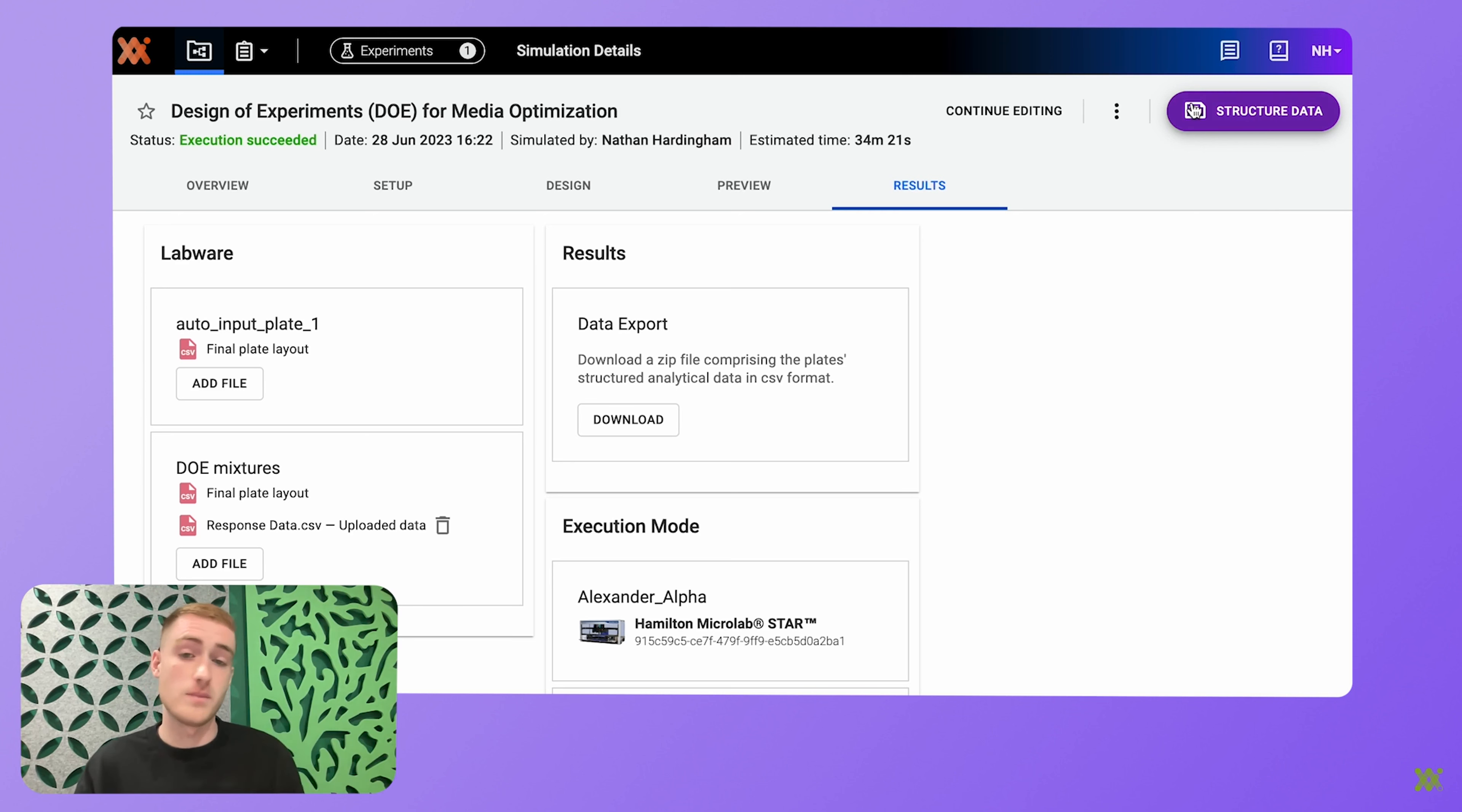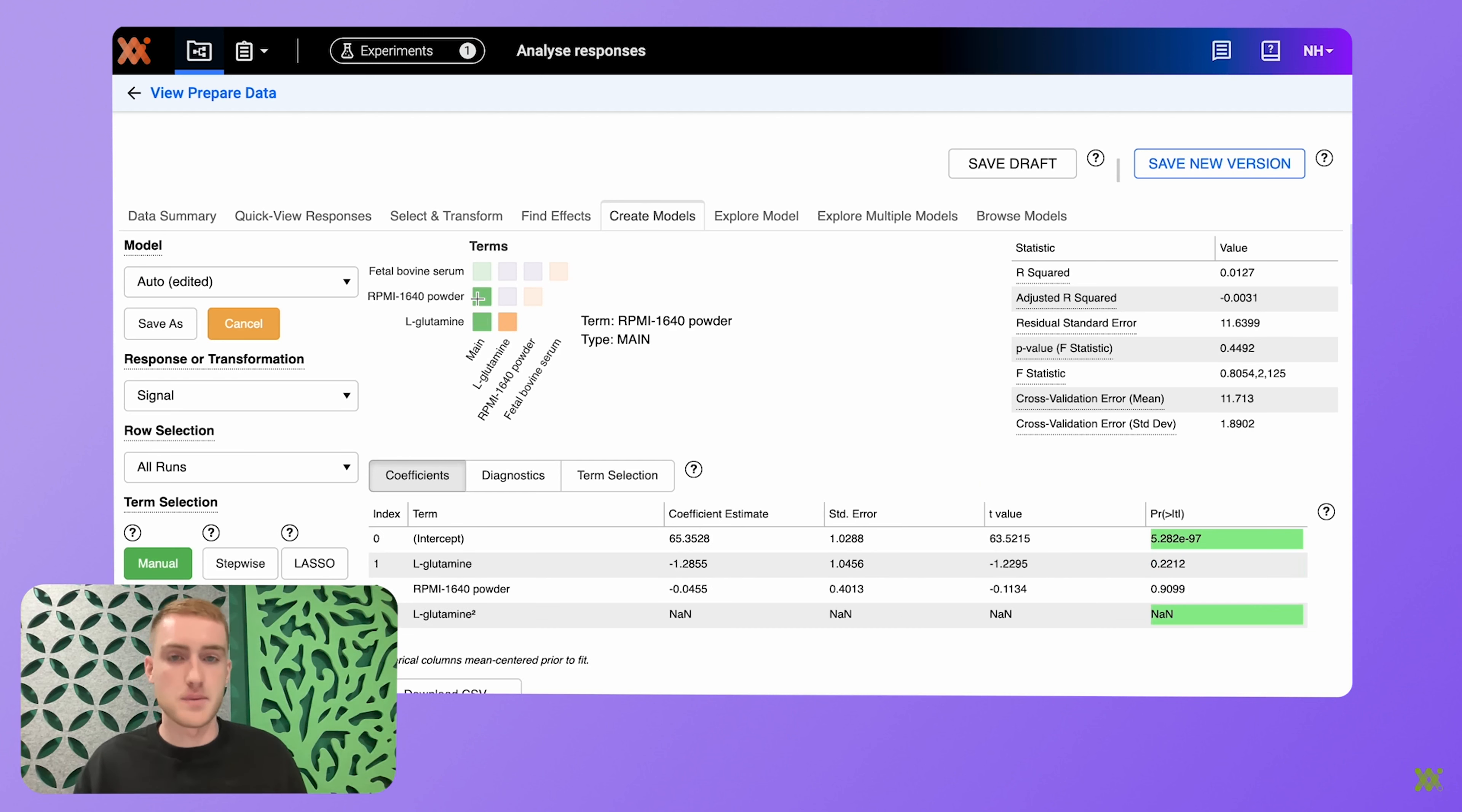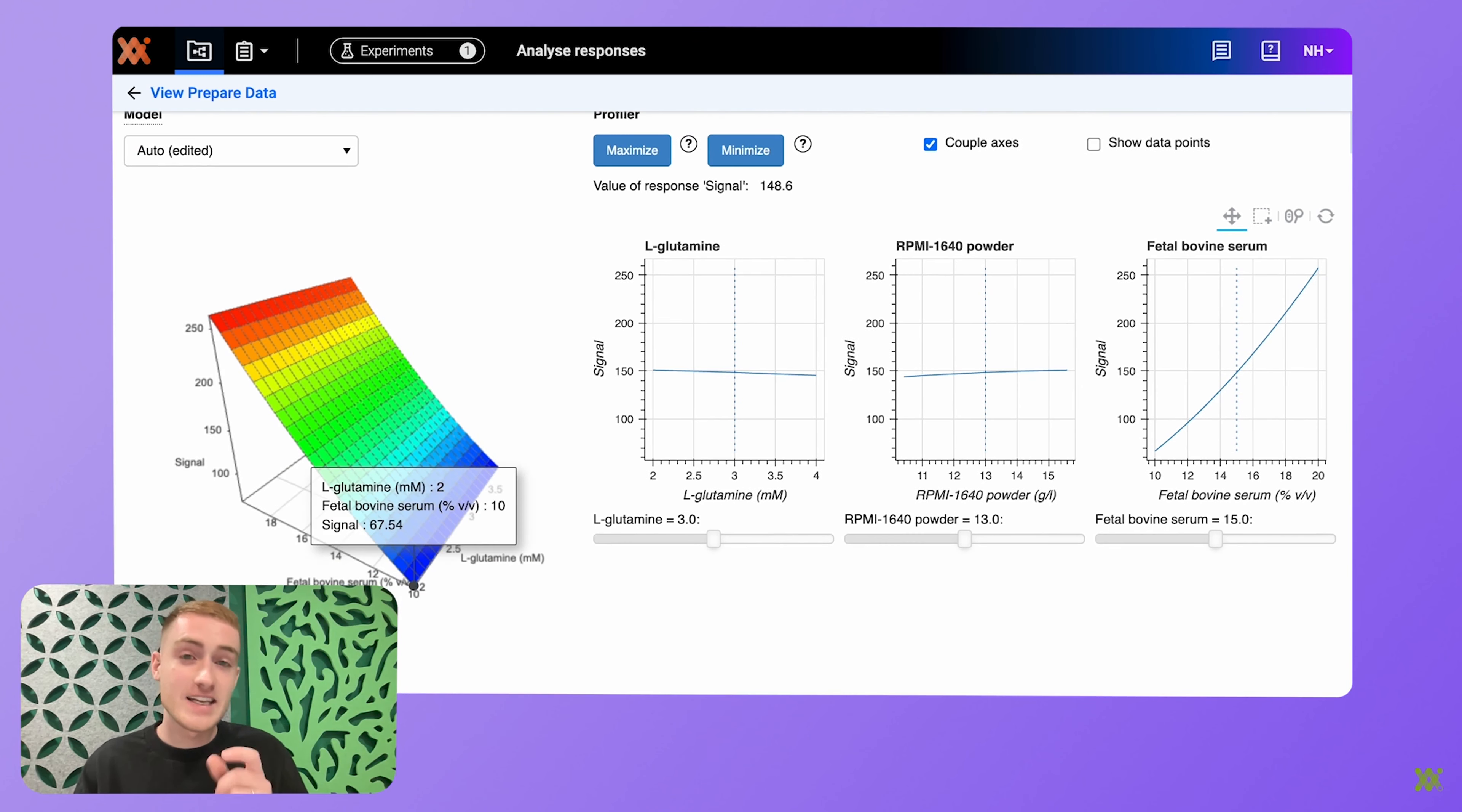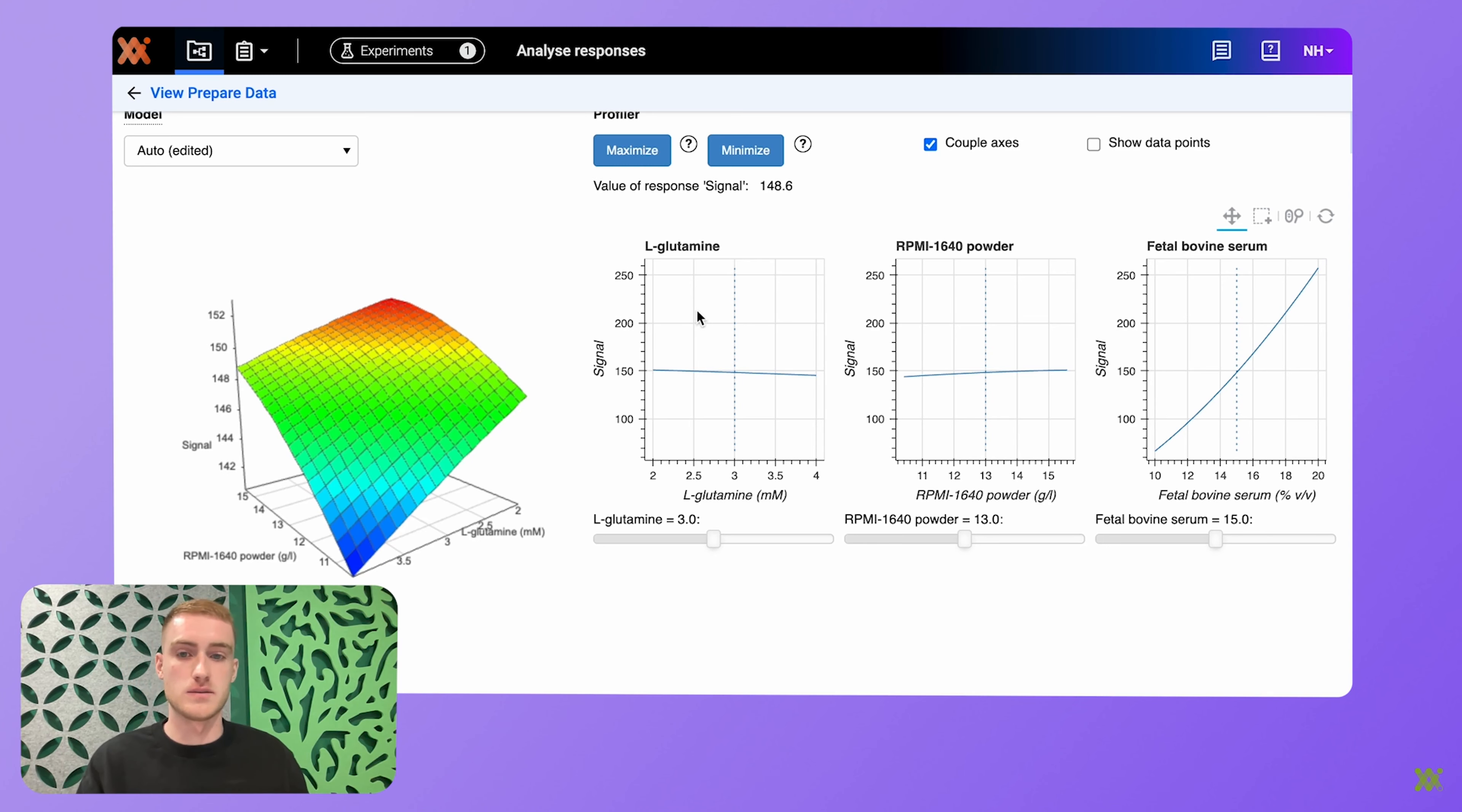From here, I'm clicking structure data, and that will transport me to a response analysis. So in this response analysis tab, I can immediately eyeball my data. And then I can jump into some in-depth analysis. You can create models here, you can explore them, go on a little adventure with your data, and then generate really powerful insights in the same software that you started your journey.